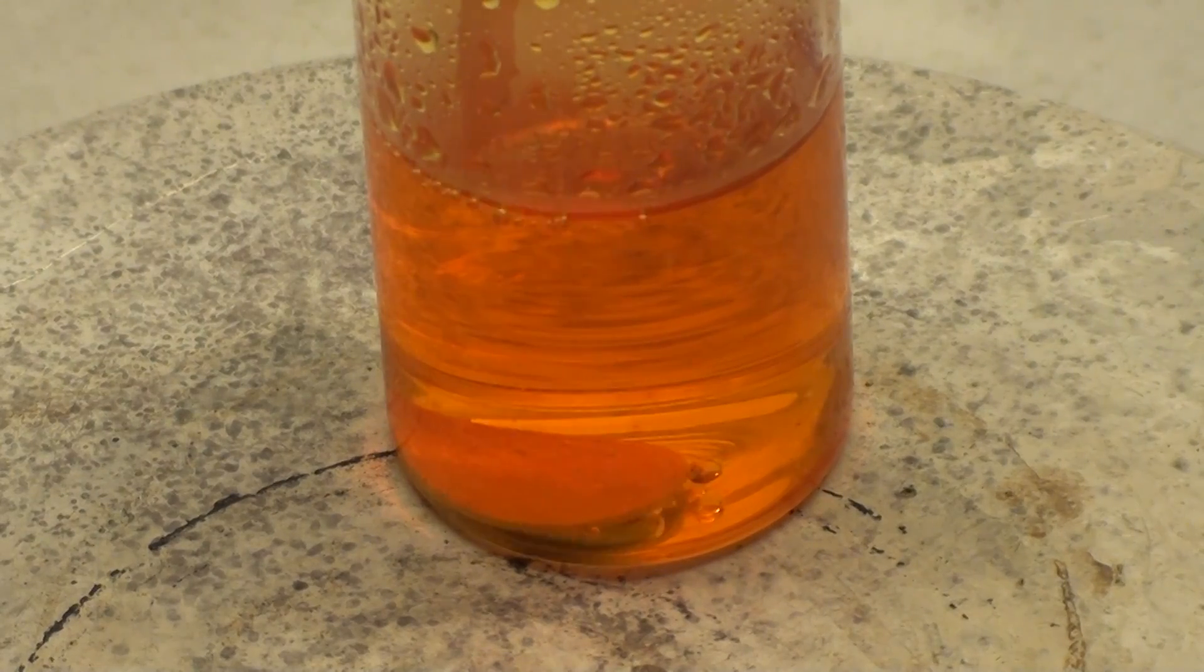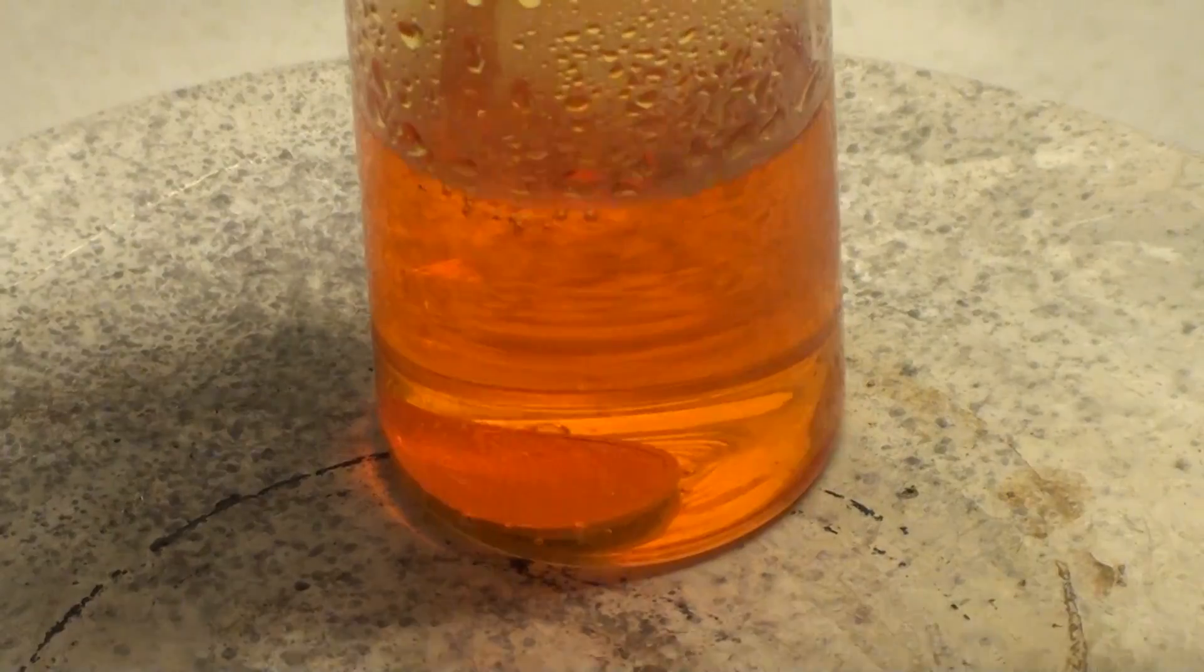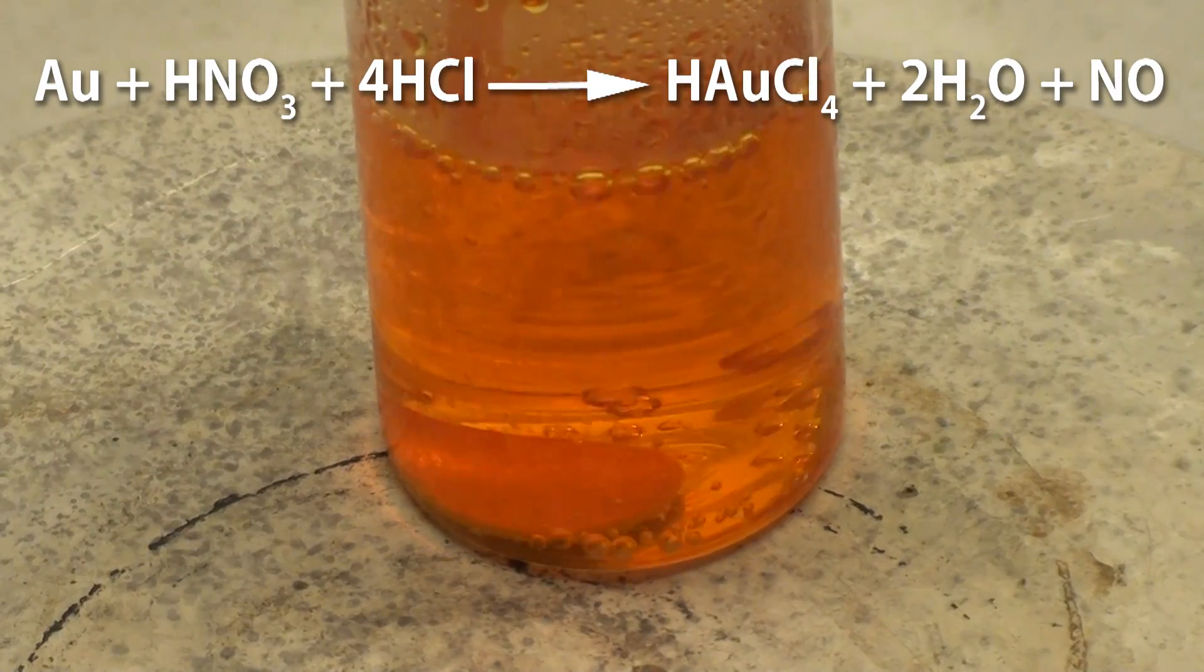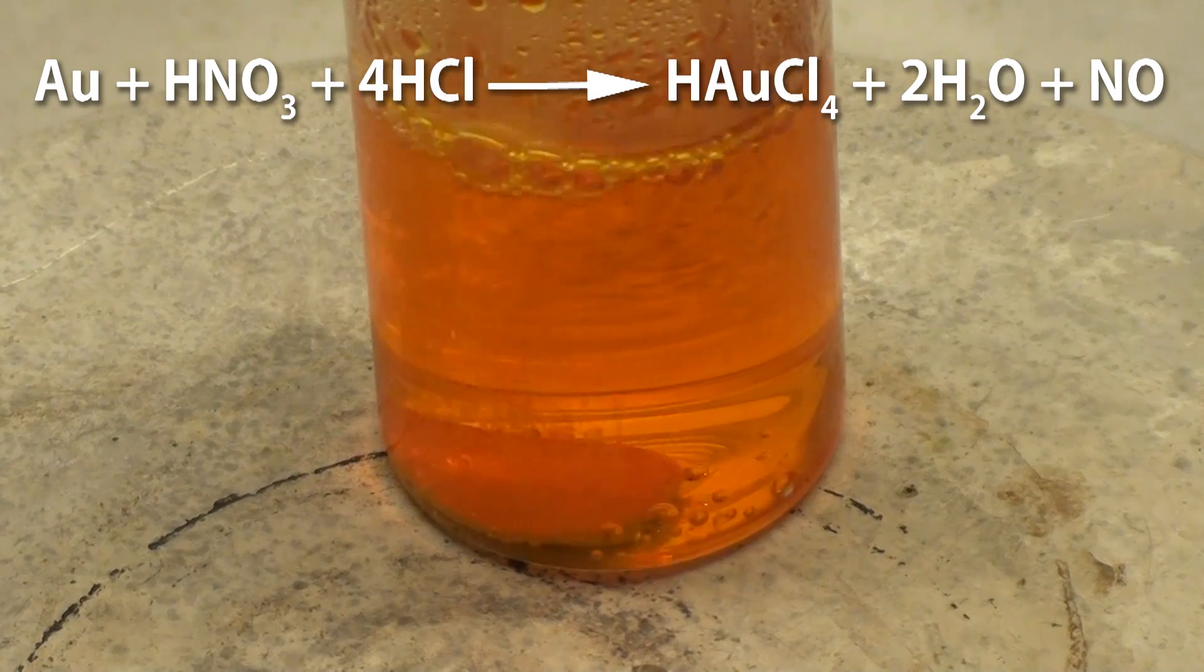Hmm, looks like the reaction is slowing down. I'm going to add another one milliliter of nitric acid. Overall what we're producing in this reaction is chloro-auric acid.